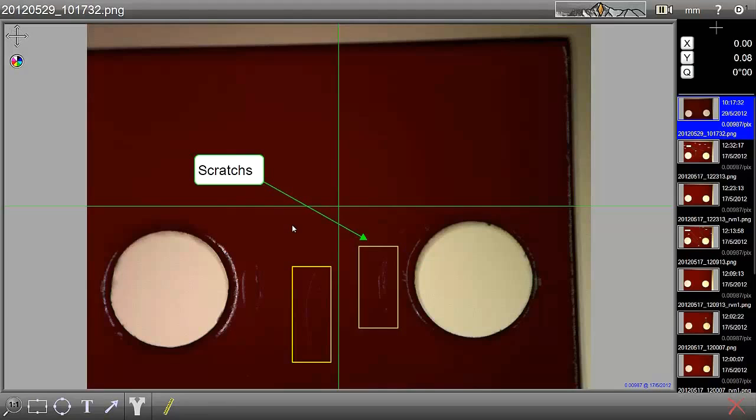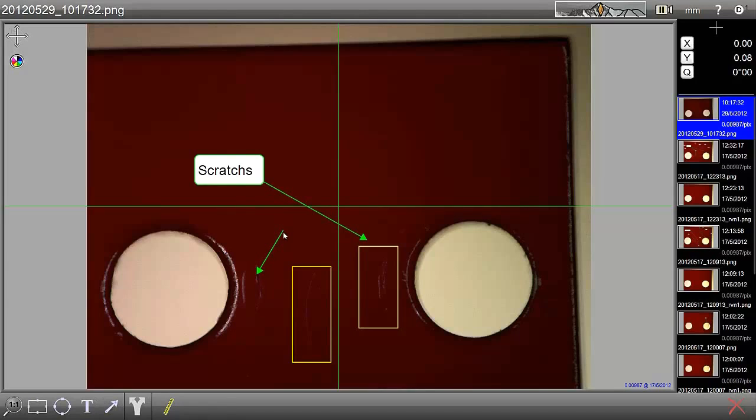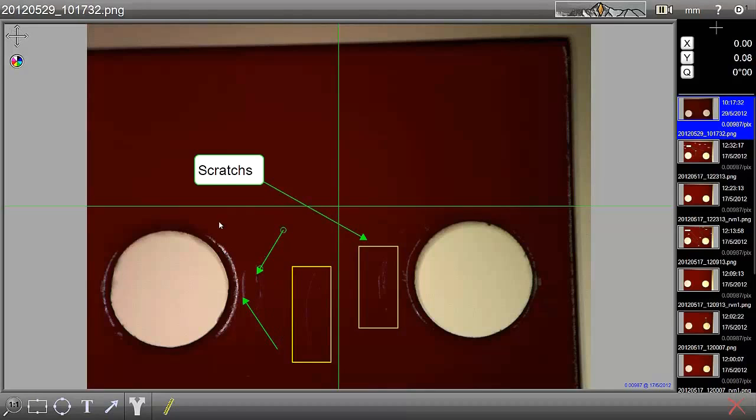Once we've done this, we may want to annotate a couple of other defects on the part. We also have the facility using an arrow tool which we can use for markup. So we select the arrow from the toolbar down here and draw on the screen. We can again select and change the color using the color wheel if we require. I will do the same thing with this second defect over here.